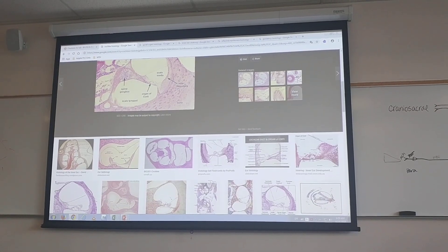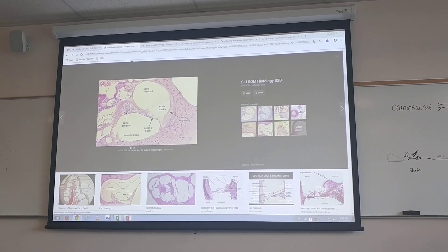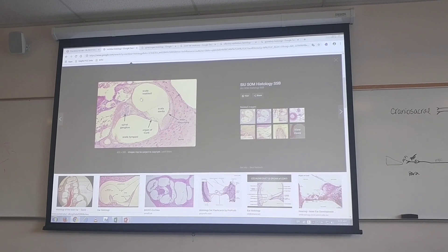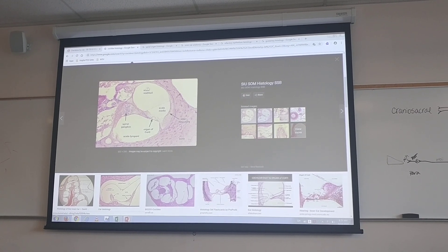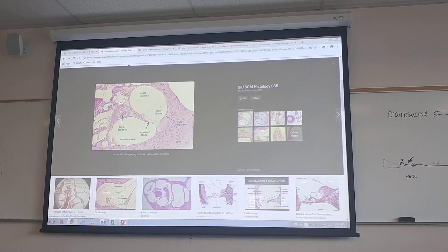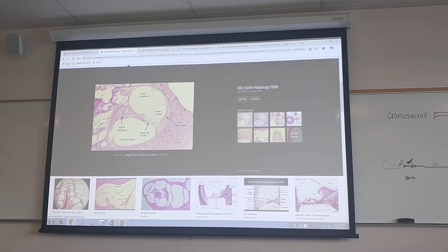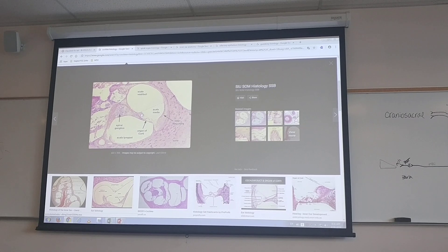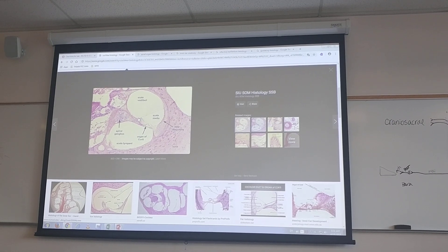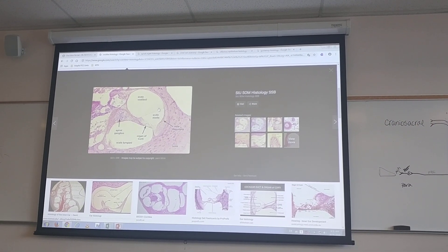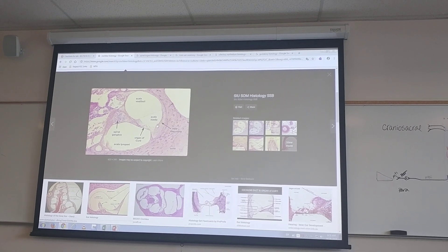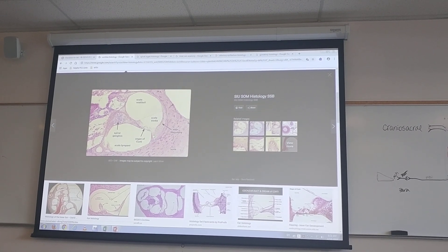We're going to look at just one of the spirals. You've got a couple things you want to find: the vestibular duct, the tympanic duct, and the cochlear duct. The great thing you're going to see is the vestibular membrane — it's going to be kind of on an angle, telling you that you are right near the vestibular duct, which is nice and big. Below it will be a smaller cochlear duct. The tympanic doesn't have that — that's how we tell the three ducts apart.